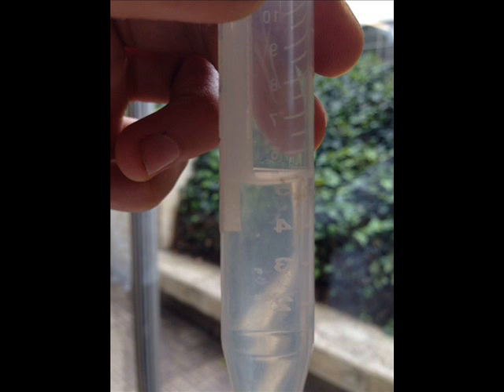The laboratory practice objectives were accomplished. The DNA isolation was successfully achieved because the DNA remains alone, as you can see in the image, without membranes or other material that may contaminate the sample.